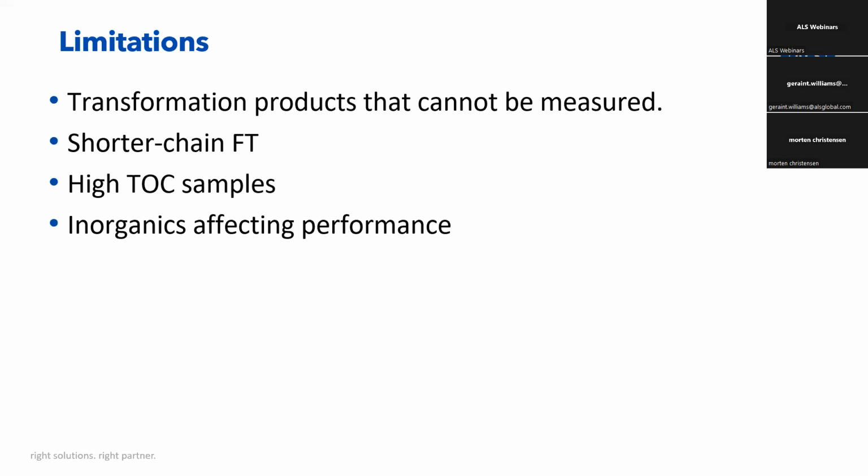Samples with ECF precursors do show relatively high yields, so you do get some concentrations with high yields. I would say one of the limitations as well is where you get some of the short chain fluorotelomer precursors. They show lower yields, and that's because of this unzipping process that I've mentioned already, and they get converted to even shorter chain PFAS.